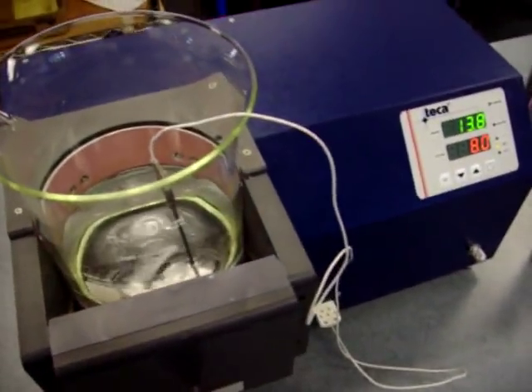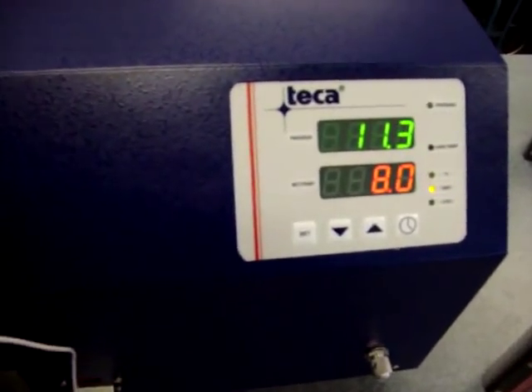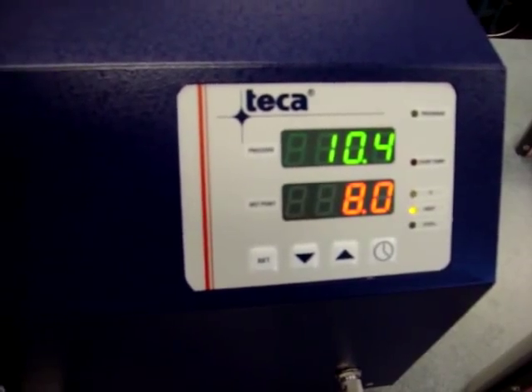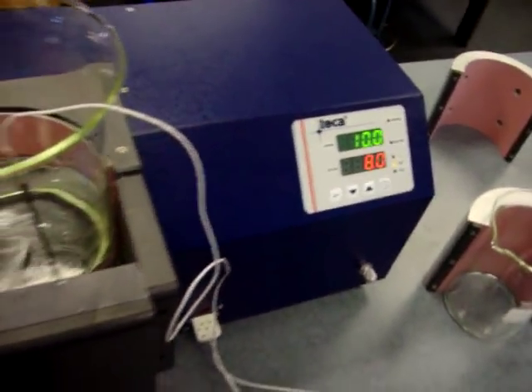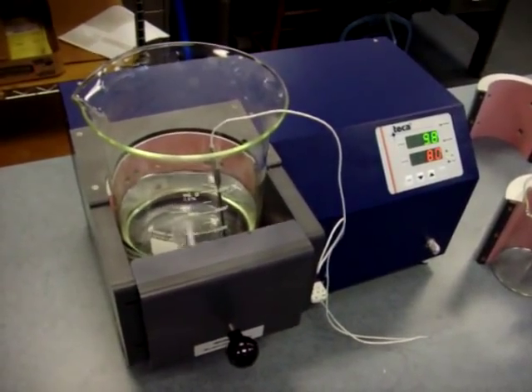Is the temperature controller built in? Temperature controller is built in. It has a fan speed control, so when it needs to be noisy it is noisy, and when it doesn't need to it's quiet. It has software that interfaces with your computer and you can program ramping and soaking features on it.